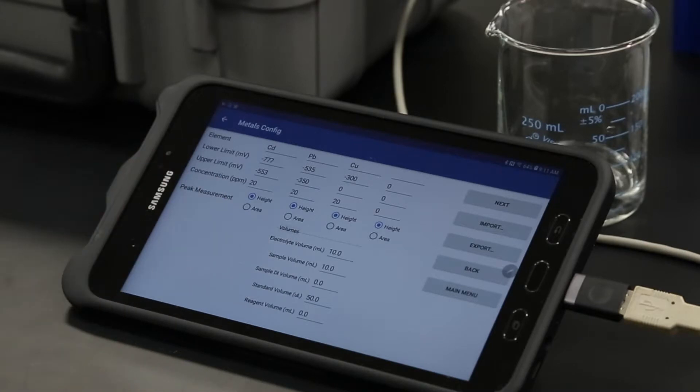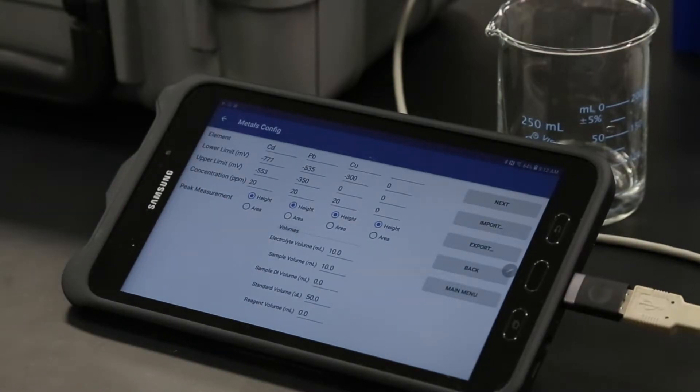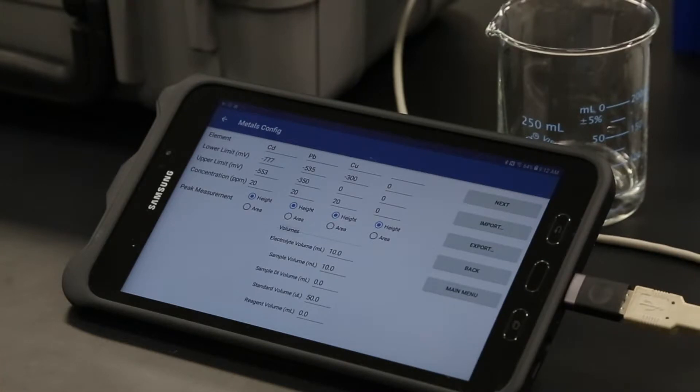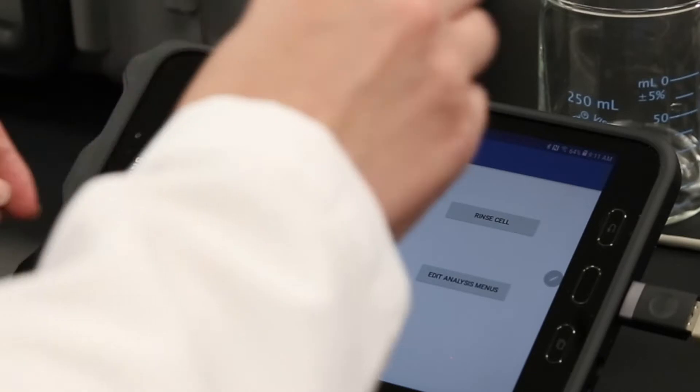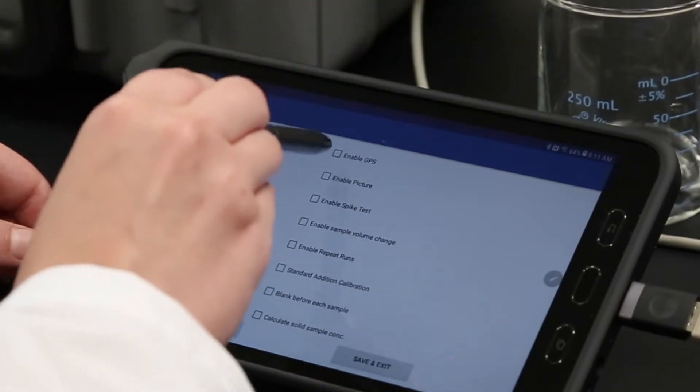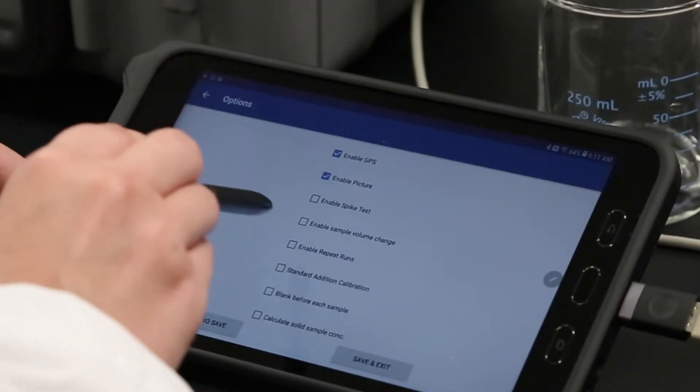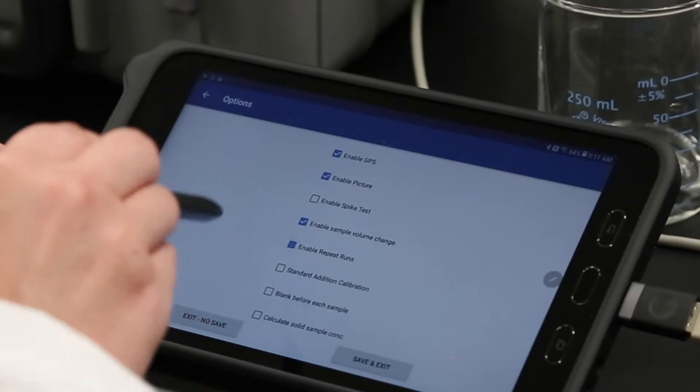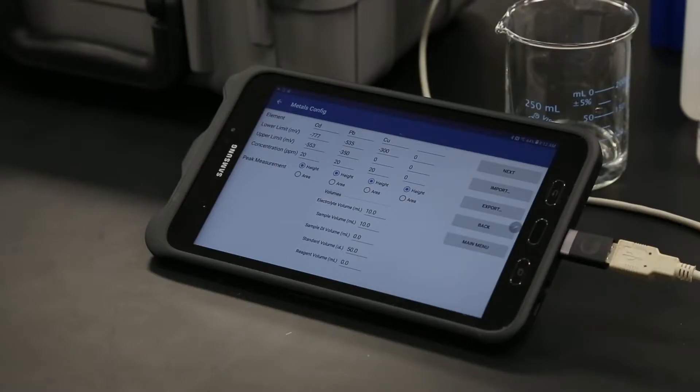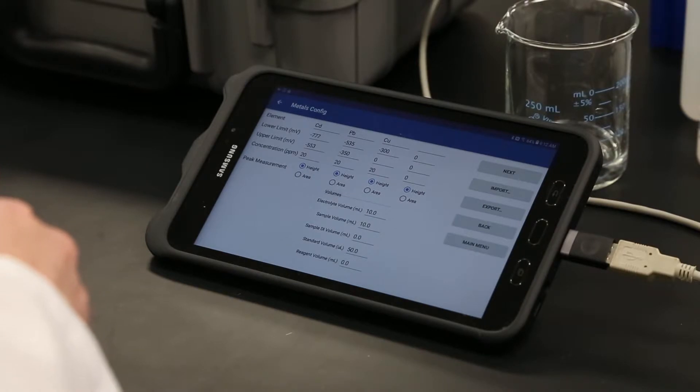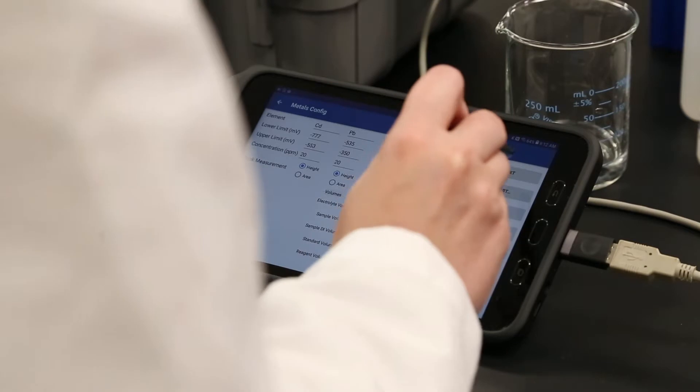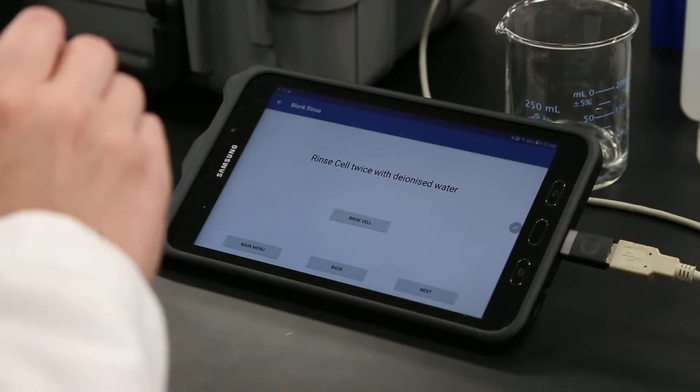To perform a standard comparison analysis, initiate the analysis procedure by selecting the Analyze Sample button from the main page. If the Enable Sample Volume Change option has been selected in the Options page, the Metals Config page will reappear to give the user the opportunity to load different application settings or change any volumes or analyte metal window details. Normally this is not required. Once changes are made, or if they are not required, click Next to initiate the analysis cycle.